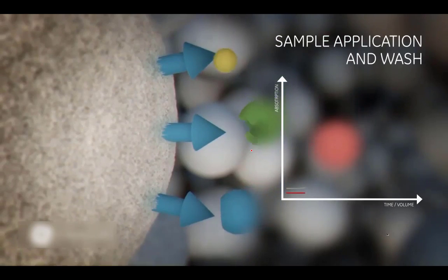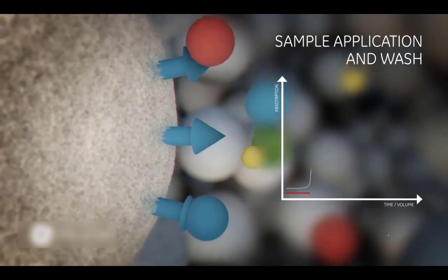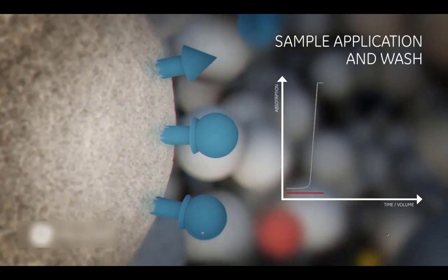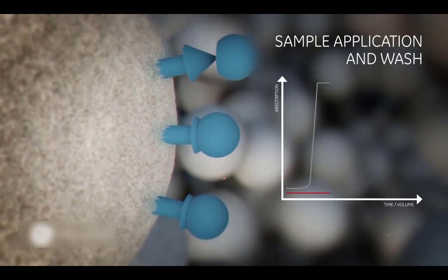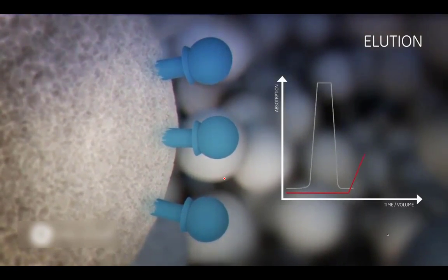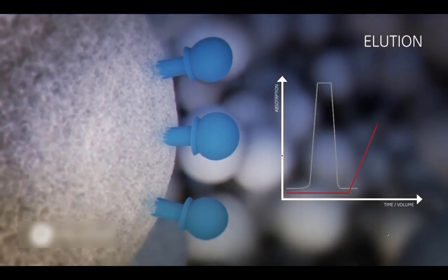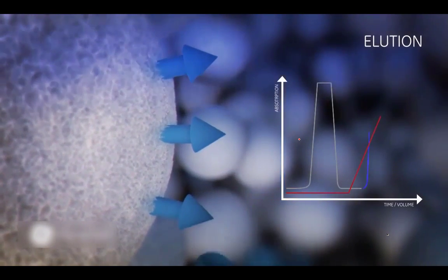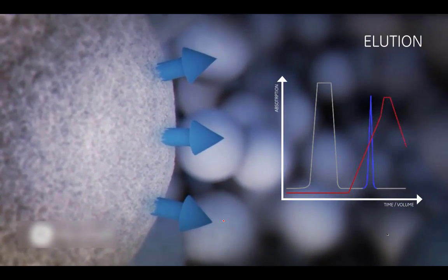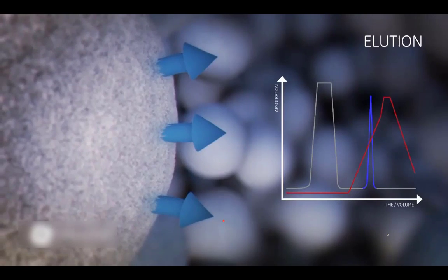Now the sample, based on its specificity, gets attached to the particular ligand, right? So the specificity is very important so that they can attach to the ligand molecule. And finally we do the separation. For the separation we add the buffer molecule that helps the detachment of the sample from the ligand. So this pH or buffer molecule dissociates the samples.